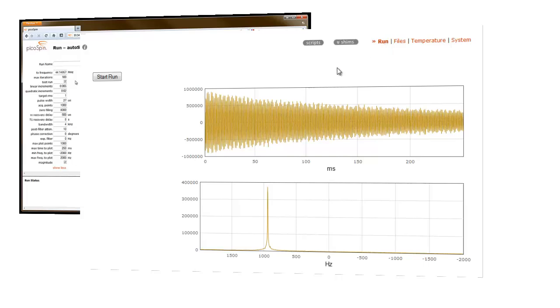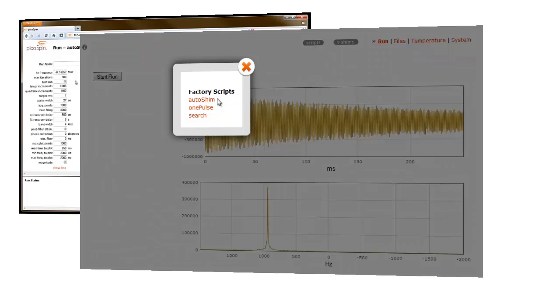If this isn't the AutoShim script, then navigate over to the Scripts button and select it. A pop-up window will appear displaying three factory default scripts: AutoShim, OnePulse, and Search. We want to select the AutoShim script.